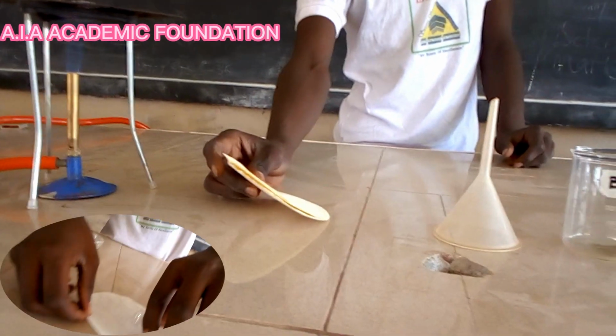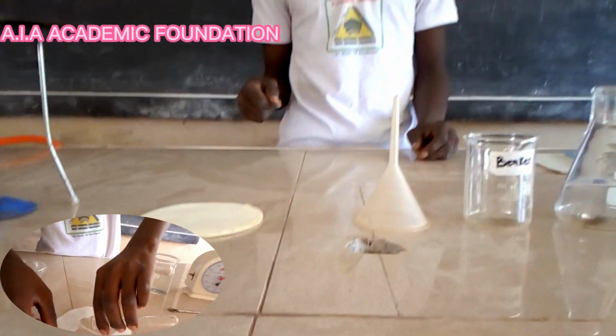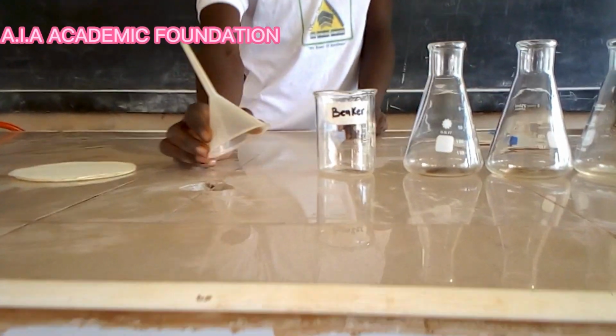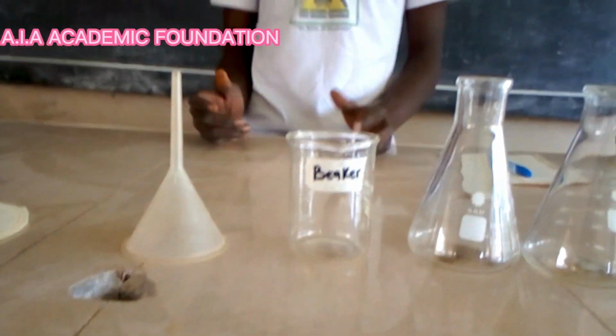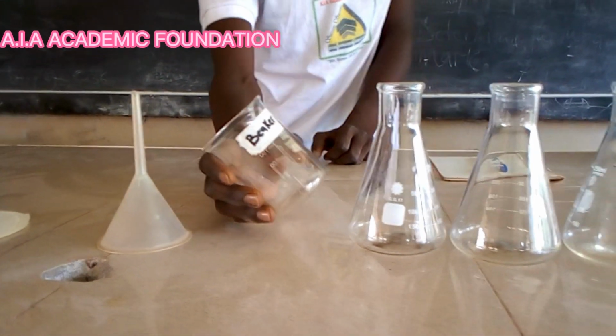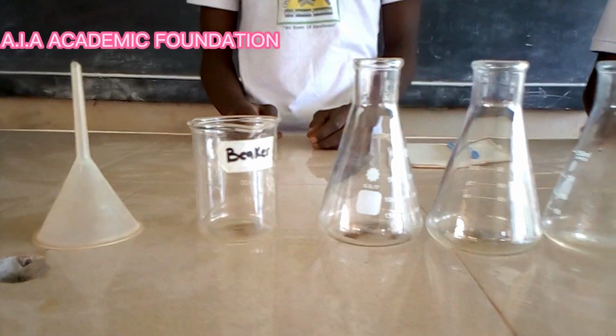We have the filter papers, where we shall pour the solution after heating. Then we see those crystals. We have the filter funnel, which will be used for filtering. We shall also use the beaker, which will be used to cool the solution.